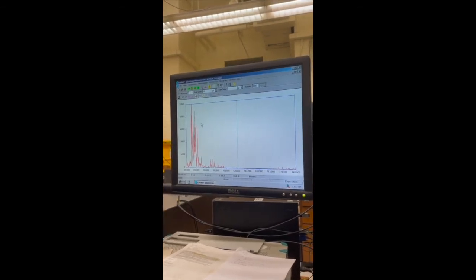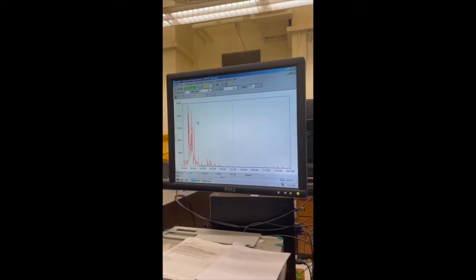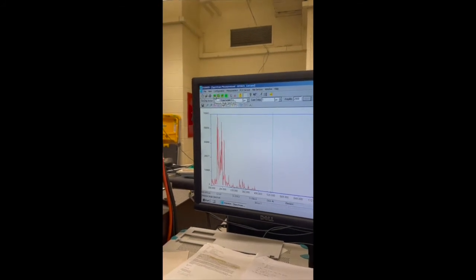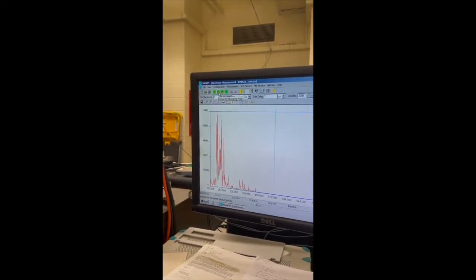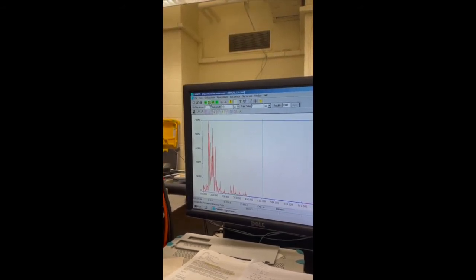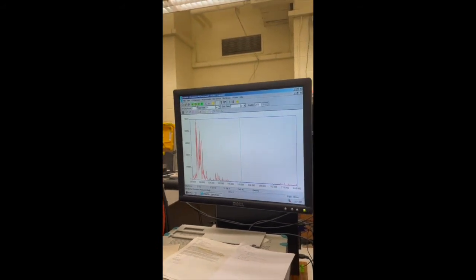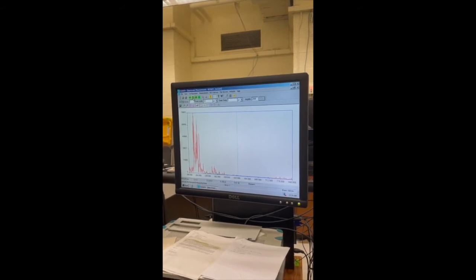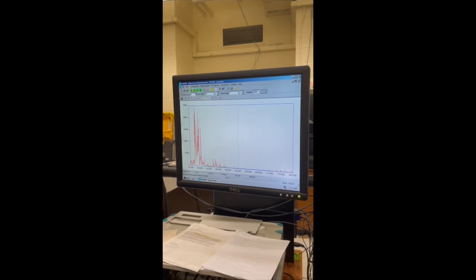But now to do that, let's look at the 4 green laser fire buttons up at the top. You are just hitting the one on the left, measure a single spectrum. If you move to the next one over, that's a permanent measuring mode. Let's actually see what that one does. I'll tell you what it's going to do, but then let's watch it. This is going to be a toggle radio button. When you press it, it will stay depressed and keep taking data until you unpress it. So that might be useful if you're actually experimenting and just wanting to see spectra come through.